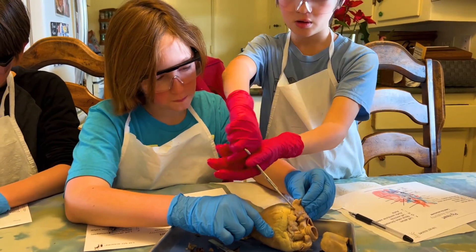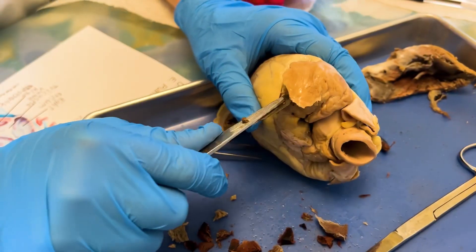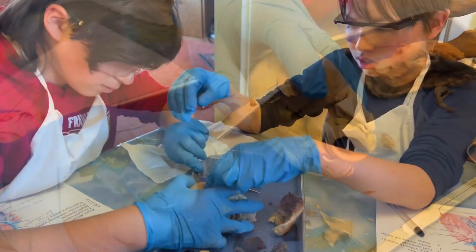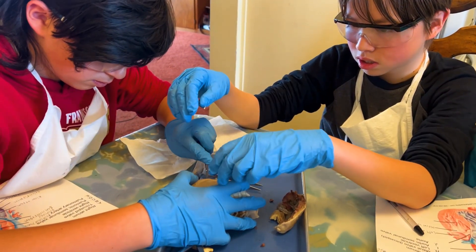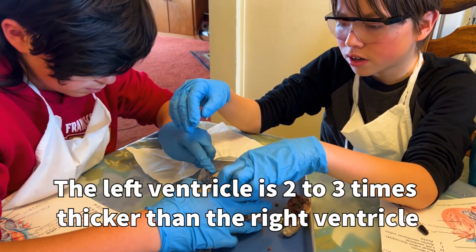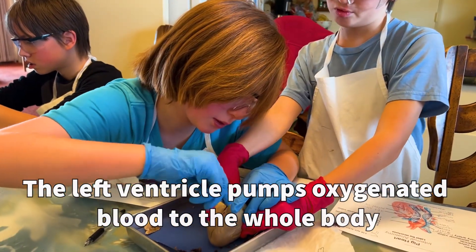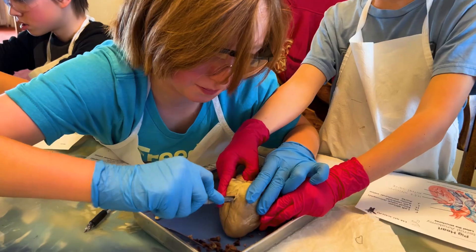These lab rats are now taking off the left atrium so we can see what that lining looks like. These lab rats are now opening up the left ventricle, which is almost two to three times as thick as the right ventricle, because this is the compartment that pumps the blood to the rest of the body, so it has to be extra strong.